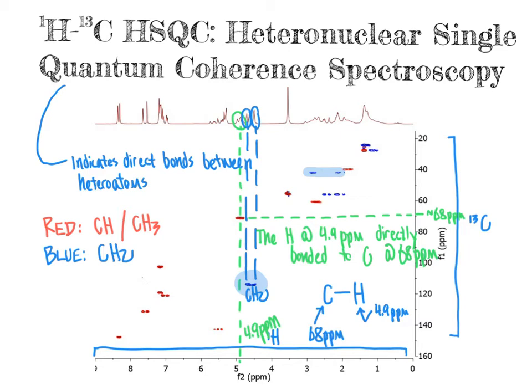HSQC is a very useful experiment for determining which heteroatoms are directly connected to one another — in this case, which hydrogens are directly bonded to which carbons. If the experiment is run appropriately, we can also determine which groups are CH or CH3 (shown as red) and which are CH2 (shown as blue), although this information is not always provided. Sometimes HSQC spectra are run without giving CH/CH2/CH3 distinction, but when that information is available, it is certainly worth using.